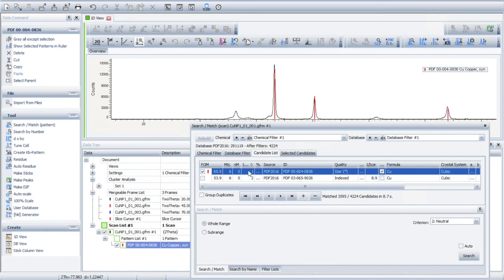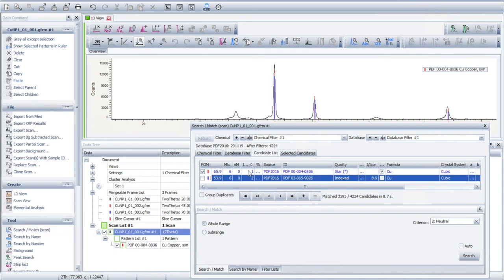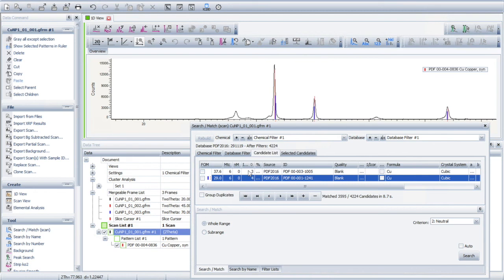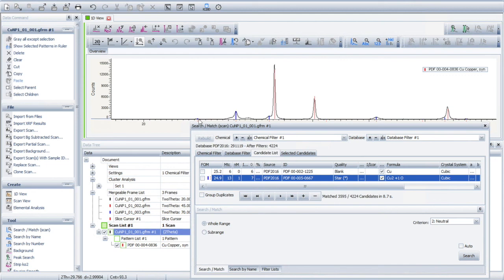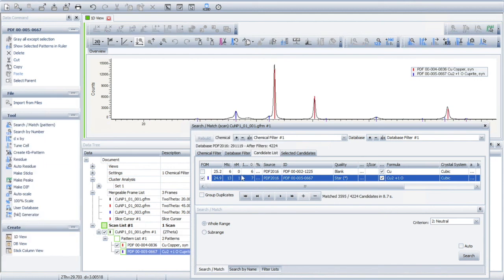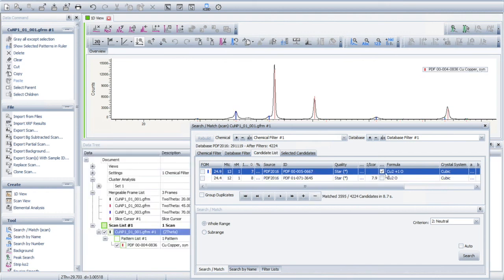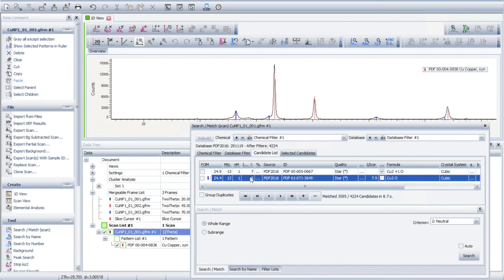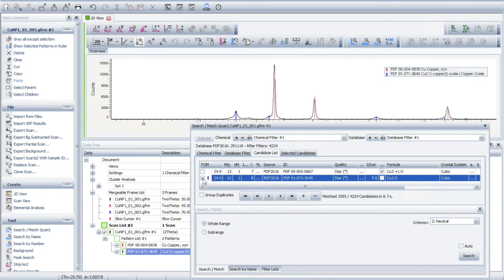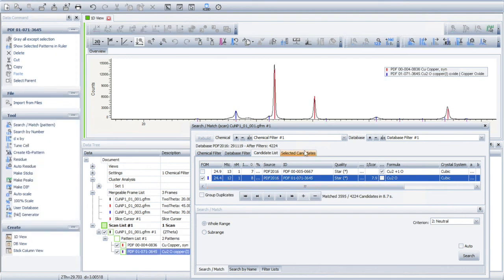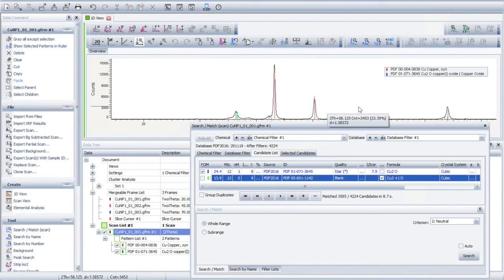And go down. Now, the other ones are in blue. Right? Okay. And so we're looking for, did we pick up other ones? Yes. Okay, this, this, that, and it might be even this one. Yeah, you see the red points? So, I'll select that one. Well, maybe that's not what I want. Okay. Deselect that one. Because it's like a weird CU2 plus one, whatever. This one, formula-wise, is more desirable. So, I'm gonna pick this one. CU2O. Right?